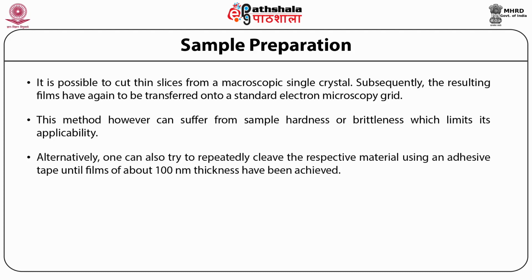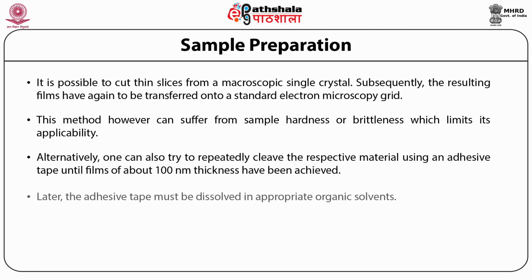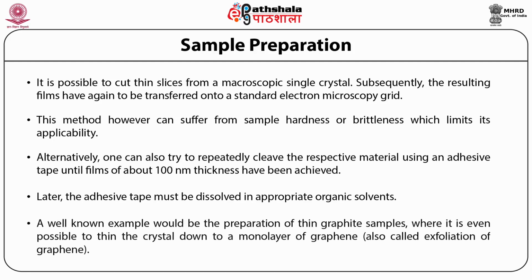Alternatively, one can also try to repeatedly cleave the respective material using an adhesive tape until a film of about 100 nanometer thickness has been achieved. Later, the adhesive tape must be dissolved in an appropriate organic solvent so that the proper analysis can be carried out. A well-known example would be the preparation of thin graphite samples.